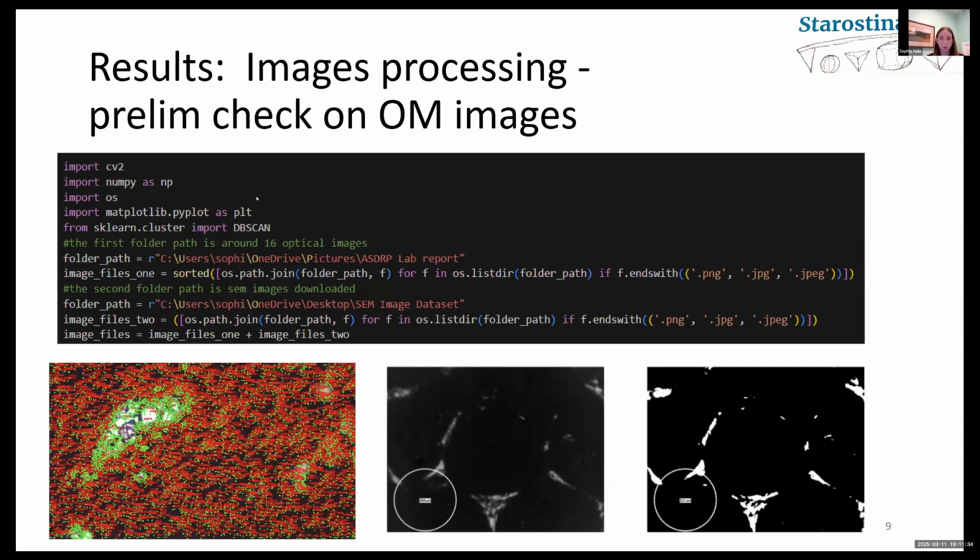We stopped using the optical microscope images because of their arbitrary shapes and difficulty with focus. With the optical microscope images, it would have required deconstructing them into regular shapes and then summarizing or combining them. So we therefore decided to start off with regular shapes and then come back to the optical microscope images after mastering the spherical and cuboidal images.